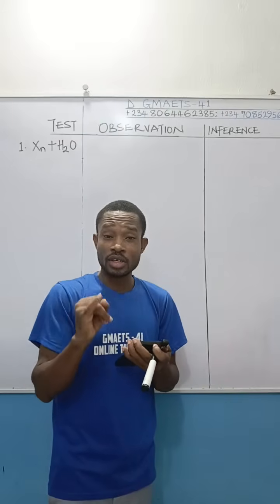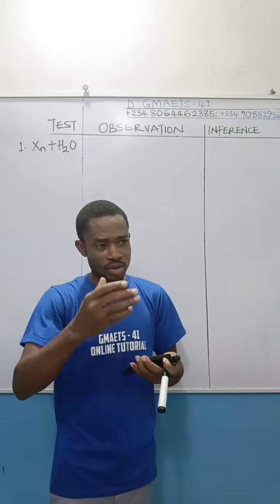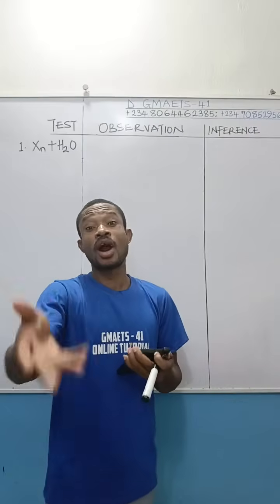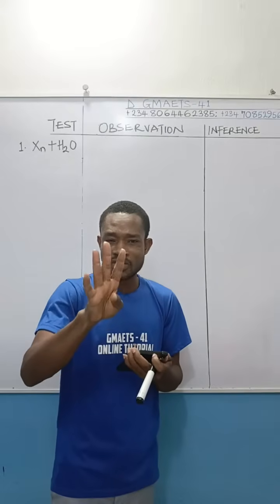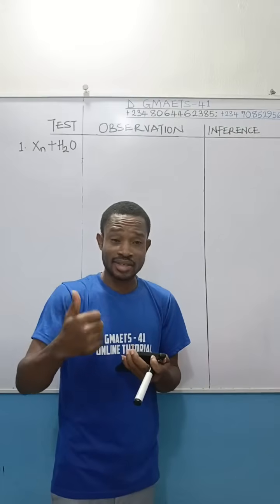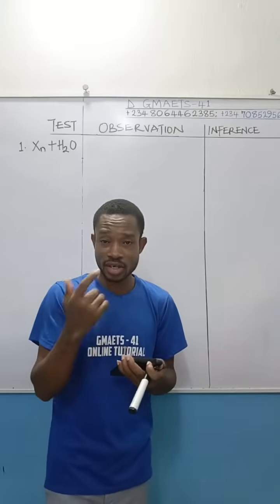Those are colored ions. Copper is blue. Iron 2 is green, dirty green. Iron 3 is brown. So with the colors, you are safe there. Where you might have a challenge is with these four other ions that are white. But if you take that video lesson I mentioned, I broke down all those concepts. We're going to work in this direction and see.